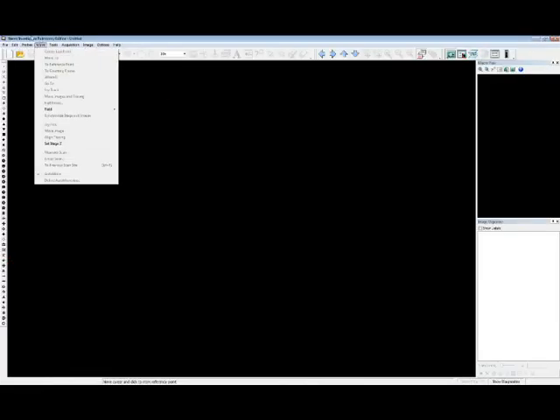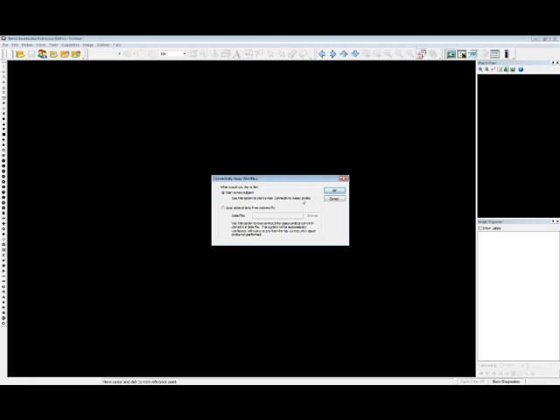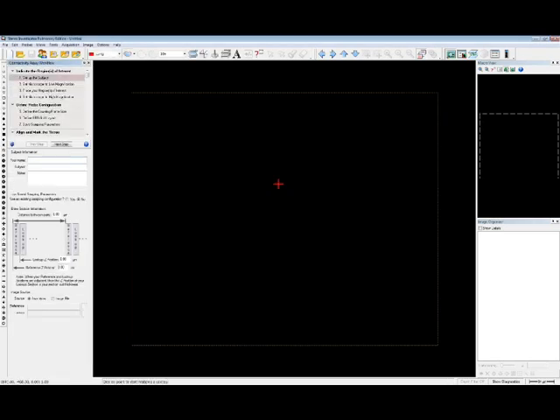What we'll do is go to probes and select the appropriate probe to work with. You'll notice it's a pretty long list, so there's a variety of probes we can choose from. Dan has discussed some of them, and we have very many of these, which would probably take us quite a few weeks to go over. But we'll go in and start the connectivity assay. We'll start a new subject.